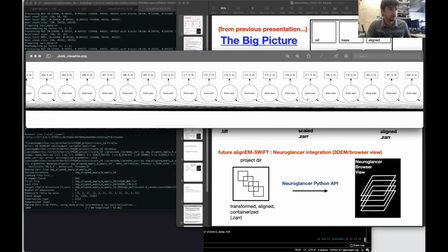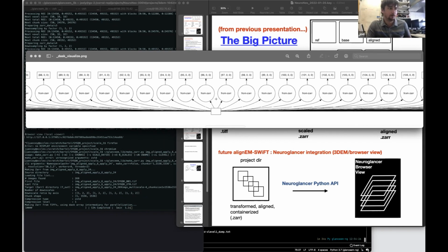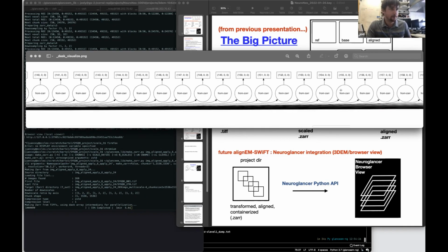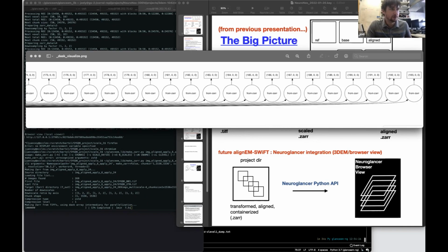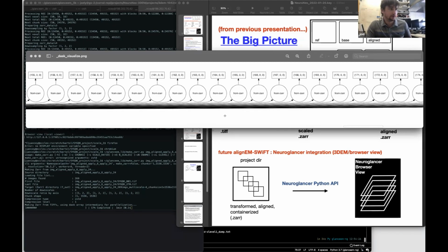So we've got all of these chunks and it's going to write to all of these chunks. And this is the task graph for the scale 0. So we're just writing the image. If you look at the numbers here, for the data set I was working with, there's about a hundred and something images, and so you can just work on all of those at once. So I just wanted to show an example of the task graph.